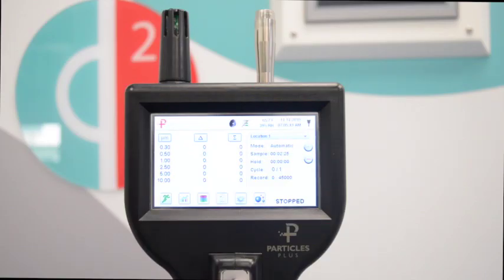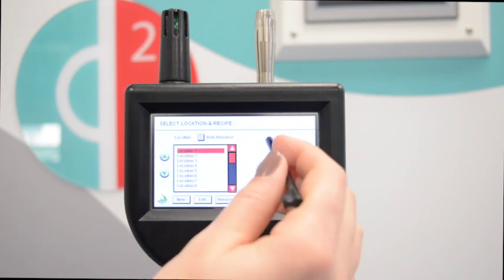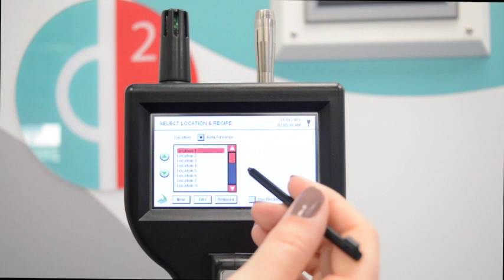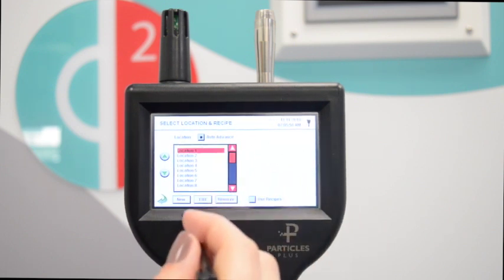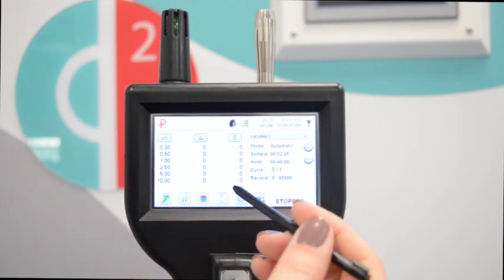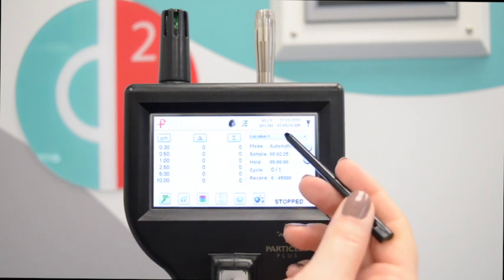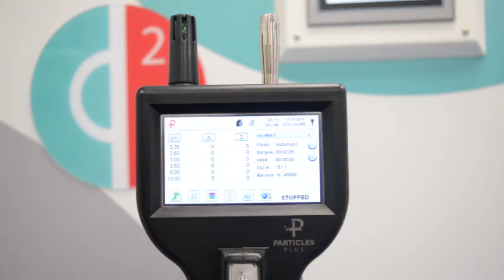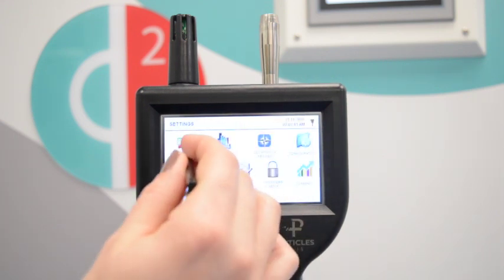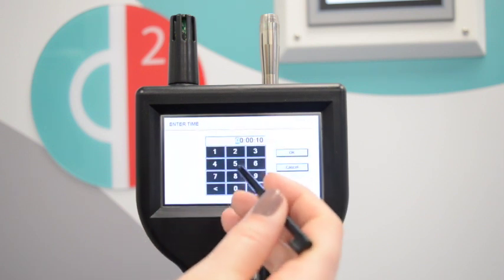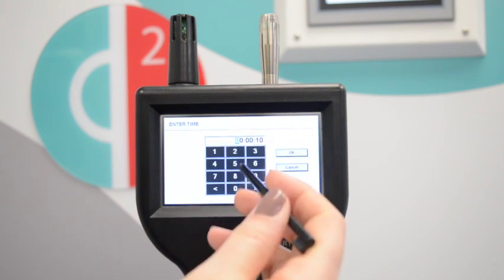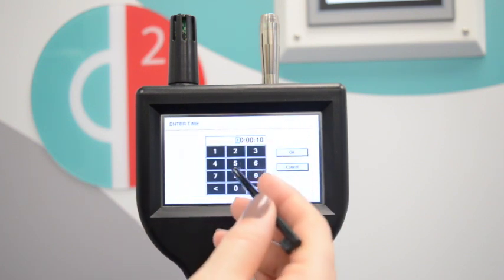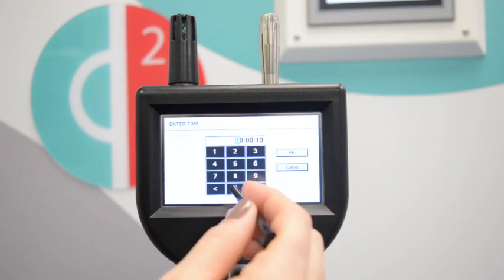For a straightforward validation you can use the auto-advance feature. Simply select auto-advance in the recipes. Go to the home screen and you will see it starting at location 1. In order to not influence counts you can set a delay in settings sample setup. This will give you time to move away from the counter before the sampling starts.